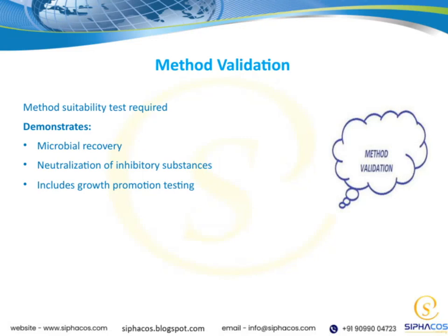Let's talk about method validation. When we're validating a method, it's crucial to perform a method suitability test. This test helps us ensure that the method is appropriate for its intended purpose. Specifically, it demonstrates two key things. First, microbial recovery, which means the method's ability to accurately detect and measure microorganisms present in the sample. Second, it confirms the neutralization of inhibitory substances, ensuring that any substances that might interfere with the detection are effectively neutralized.